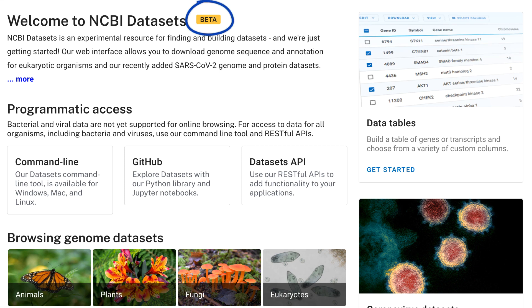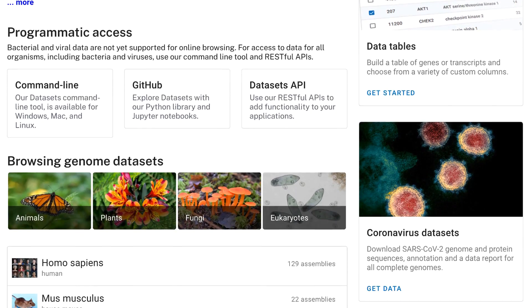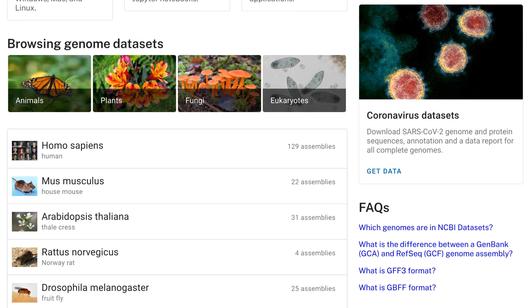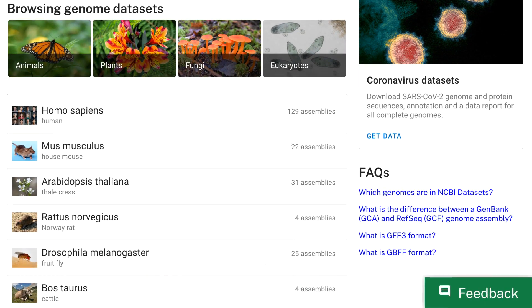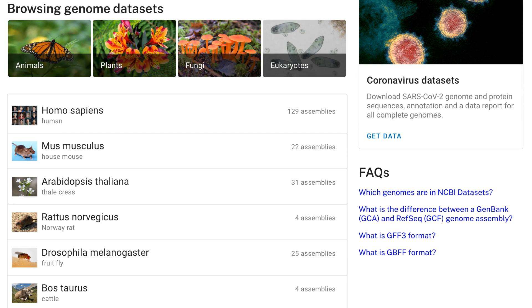Notice that this resource is in beta, and as we develop to add new features and functionality, we would love to have your feedback. Now let's use the web interface to download a custom genome dataset. In this example, I'll show you how you can easily find the latest sequence and annotation for the human reference genome GRCh38.